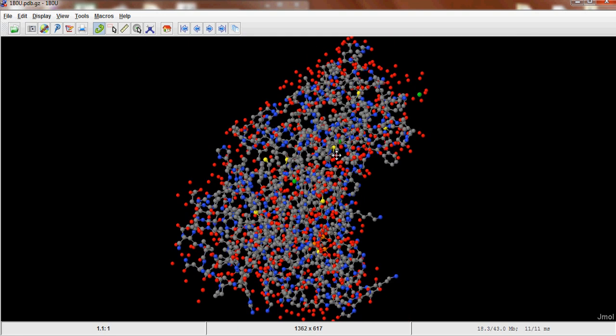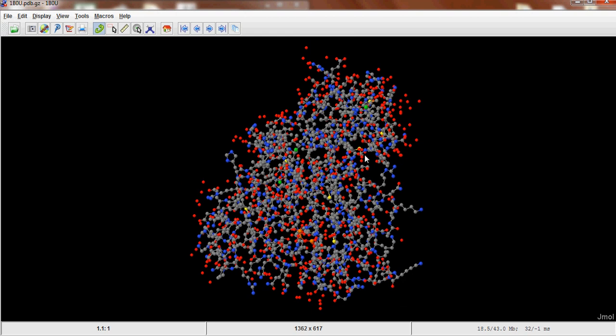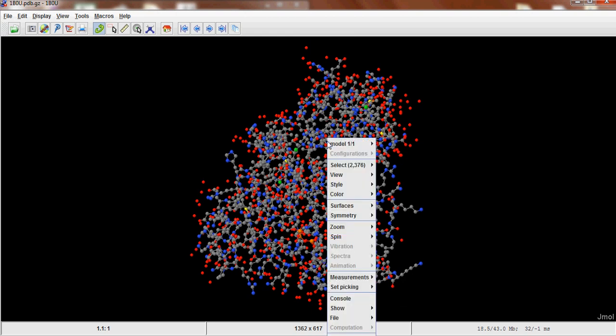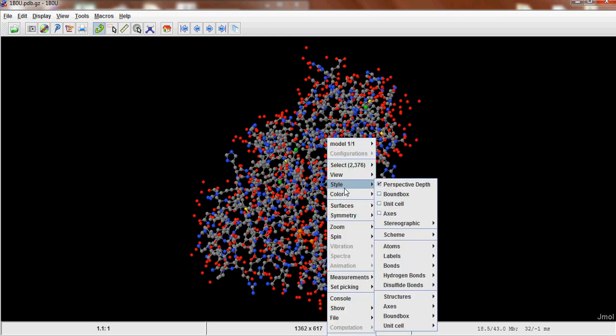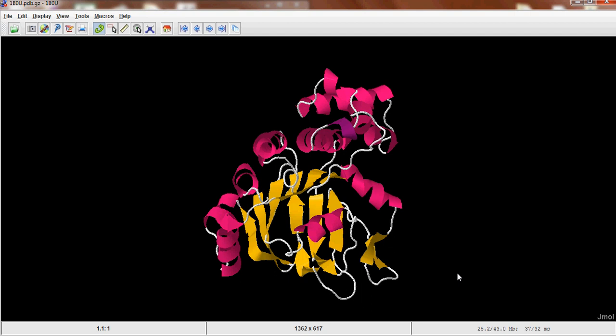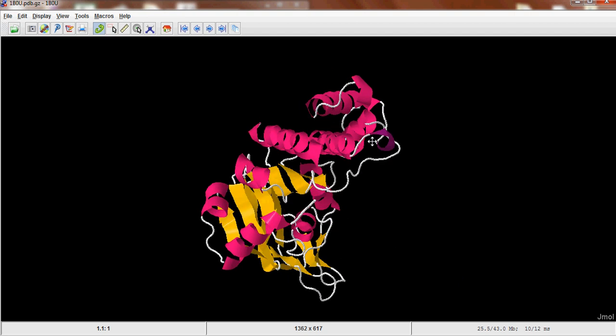So if you zoom out of this a little bit and then right click, go Style, Scheme, Cartoon, you'll get a nice cartoon representation of your protein.